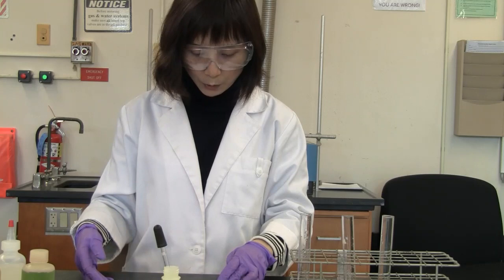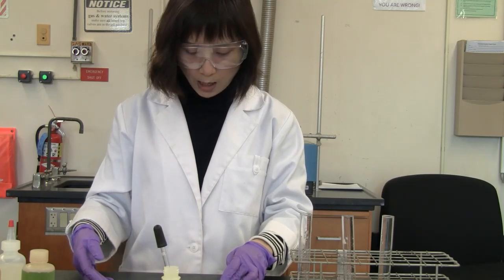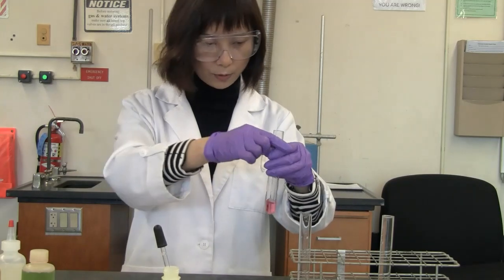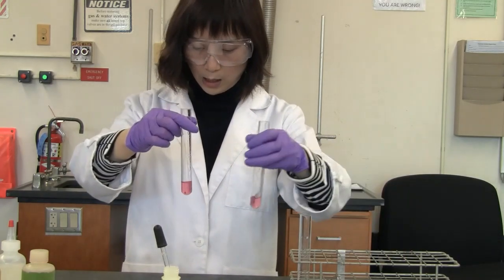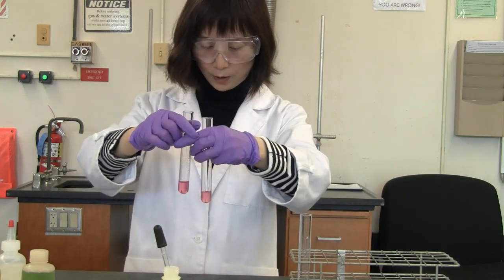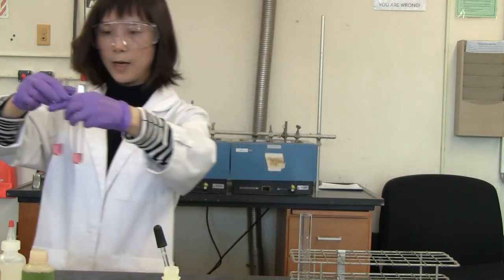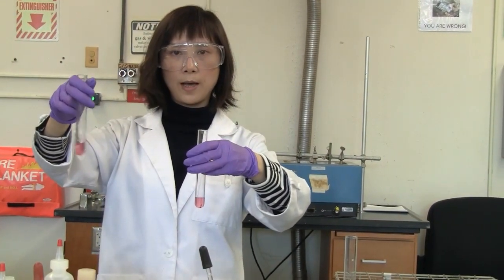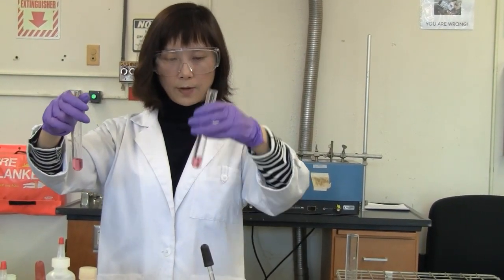This time we are going to put a test tube with the ammonium chloride, number 2, and the control in boiling water. Okay, so you're going to see the color change. All right, so this side will be the one with the ammonium chloride. This one is the control.